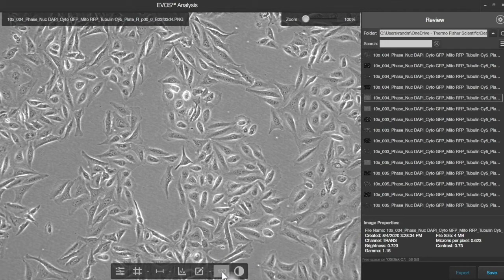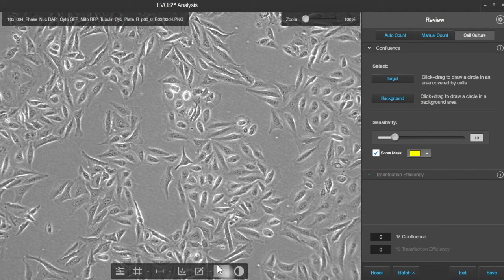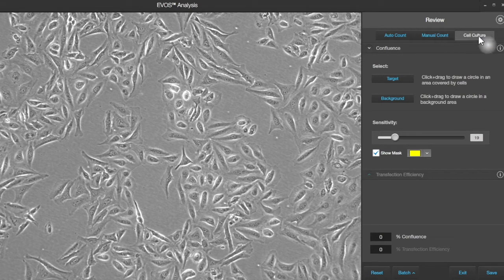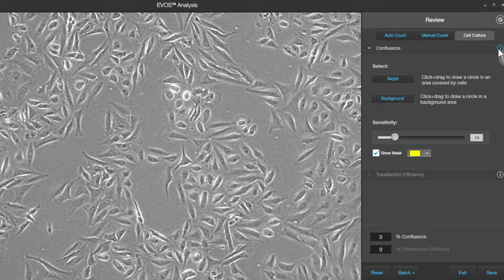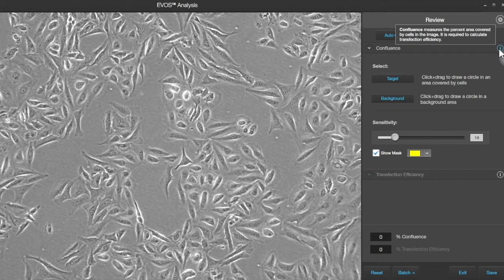Clicking on the show cell count tool brings up three different methods of doing cell count: one's an auto count, one's a manual count, and in this one we've actually got calculations of confluence and transfection efficiency. We'll start with confluence because confluence calculates the area of the image that's covered by cells — we'll need that first.